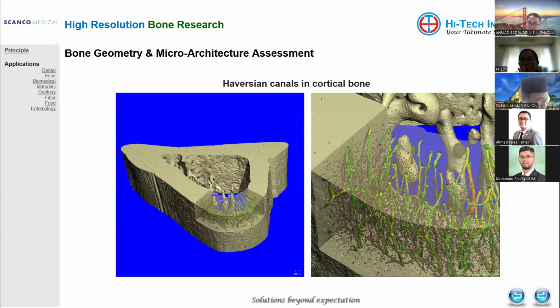Number two, you did mention bone density. May I know if your bone density is based on gray values or Hounsfield values or any other values? Both of them, gray values and also HA, I see. Or do you use the same principle as CT?